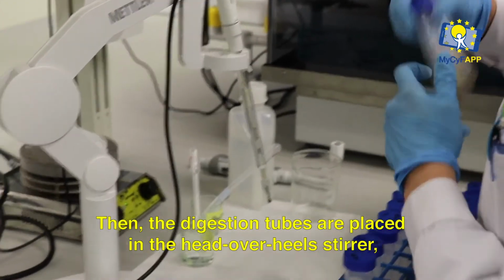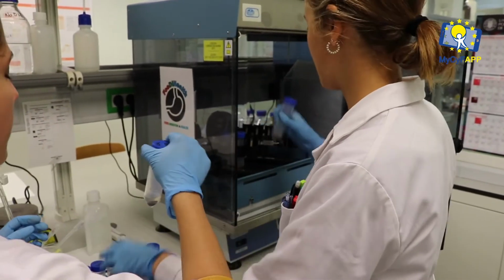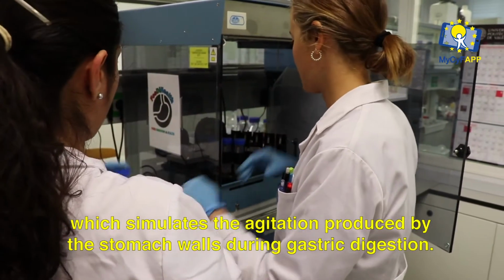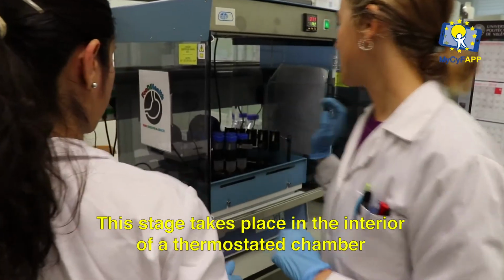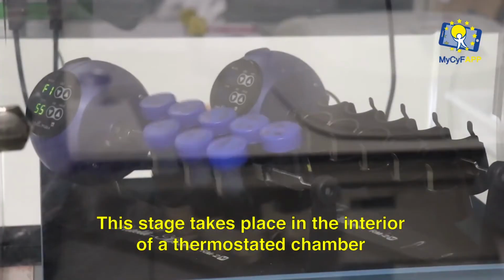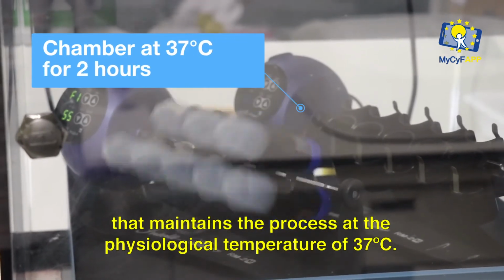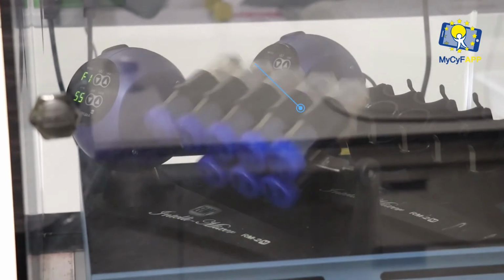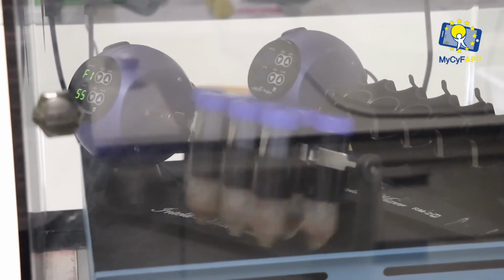Then the digestion tubes are placed in the head-over-heels stirrer, which simulates the agitation produced by the stomach walls during gastric digestion. This stage takes place in the interior of a thermostated chamber that maintains the process at a physiological temperature of 37 degrees. This stage has a duration of 2 hours.